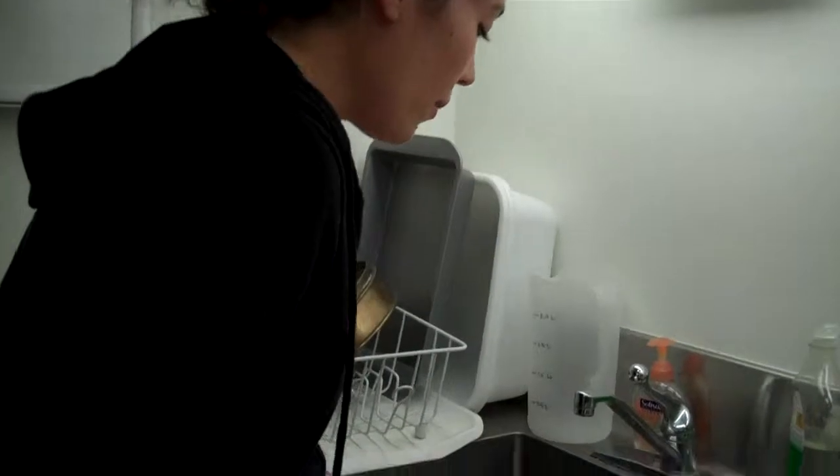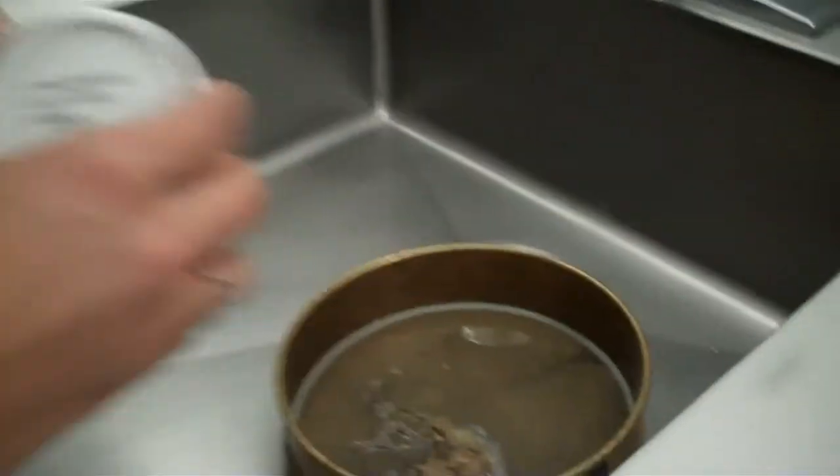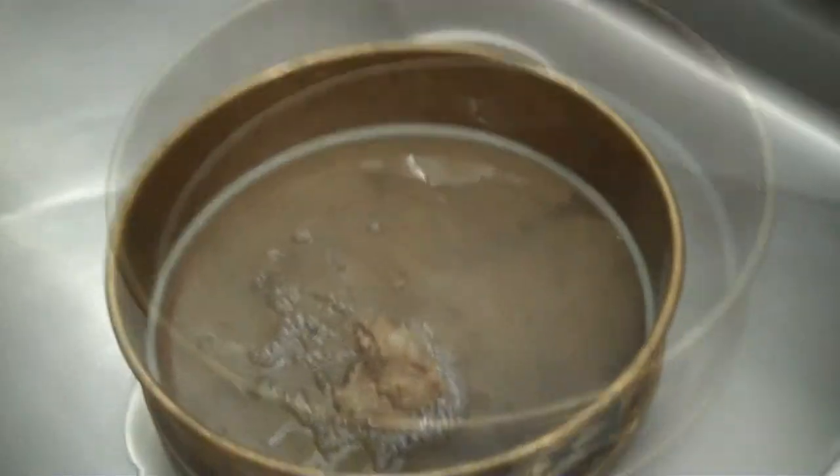When we get back to the lab, we soak the pellets in water, which makes them softer and easier to look through. We then run them through a sieve in order to sift out all of the hard parts that we want to collect.